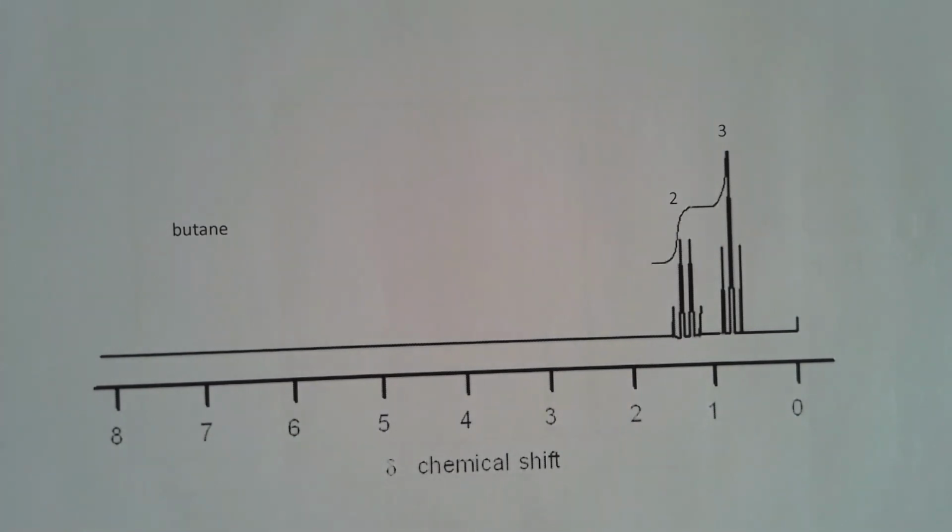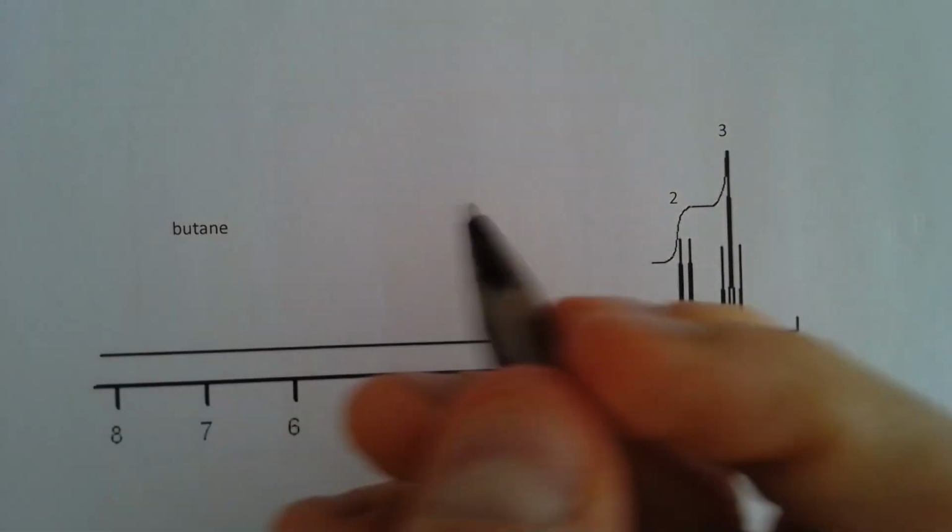Butane. From this point on, if you want to pause the video and have a go at predicting some of them yourselves, then restart the video and listen to how I've explained it. So butane, we're going to need to draw the structure first of all.